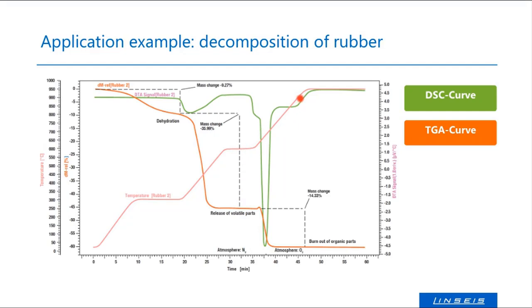So we went on with heating, and during the third heating, now with oxygen containing atmosphere, there was a huge exothermic effect. That means a huge energy release because the carbon content now was able to burn off. And this mass loss here shows how much carbon was more or less burning off. So the residual mass, the 40% that did not vanish and is still there, must be some inorganics like metals or metal salts or metal oxides.